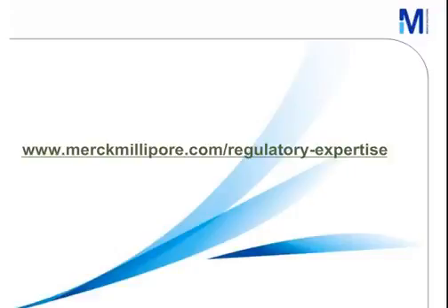Since now the laboratory should be accredited under new ISO 11133, that's not, thank you very much, it's not so easy to answer because the accreditation will be on methods normally. If you are an accredited lab according to ISO 17025, this would include then the quality control of culture media preparation and quality control of culture media according to ISO 11133.